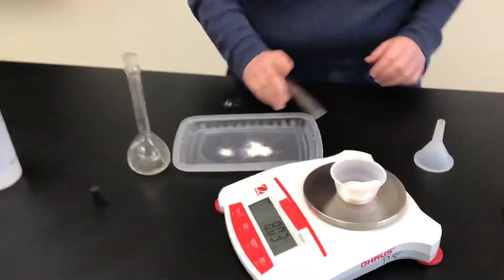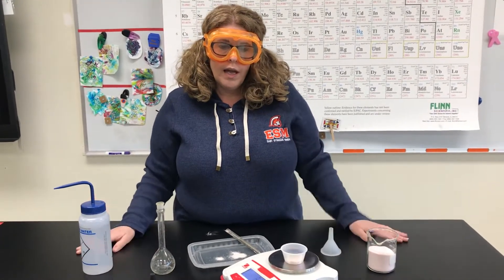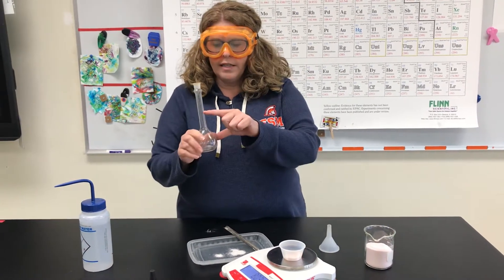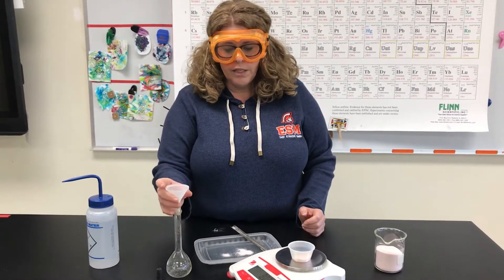That's close enough. So now I need to get this to dissolve in water. I'm either going to put the water in first or the Kool-Aid in first — think about that for a second. Which would be better to put in first? I need to get this line up to here. We're going to do the Kool-Aid first — you always start with the solid. In order to make the transfer a little bit easier, I'm going to use a funnel.